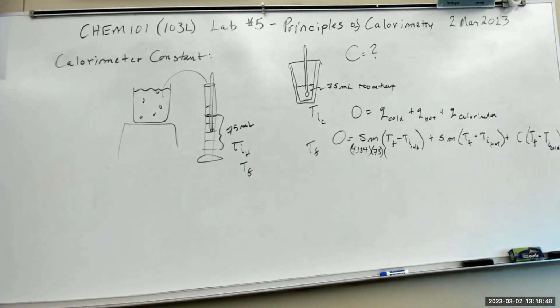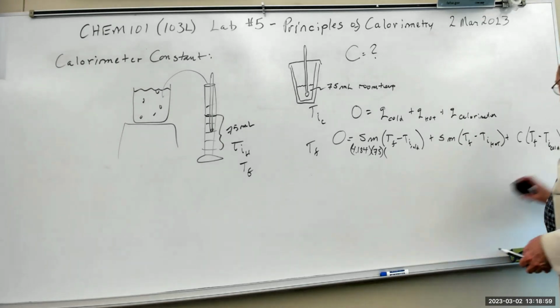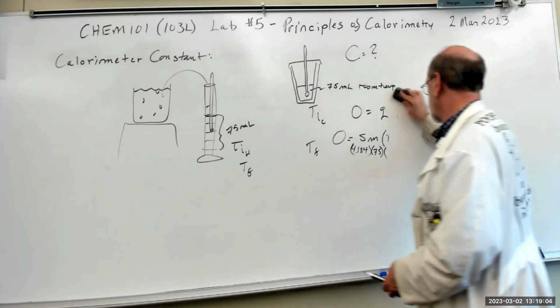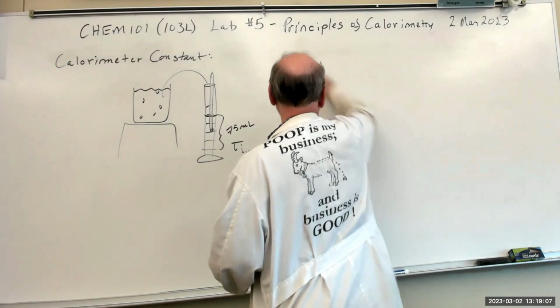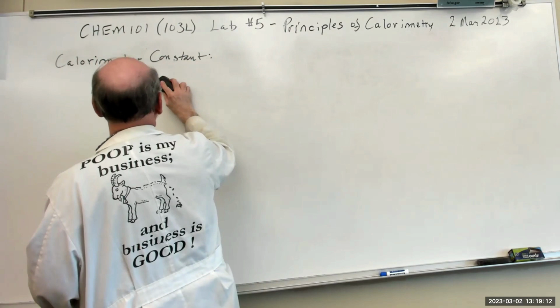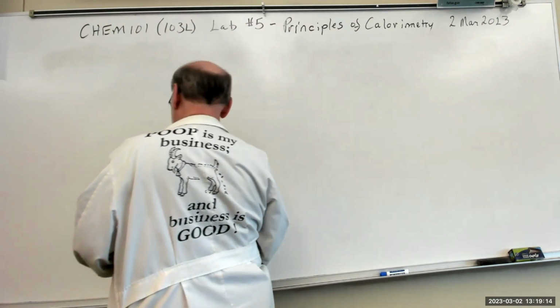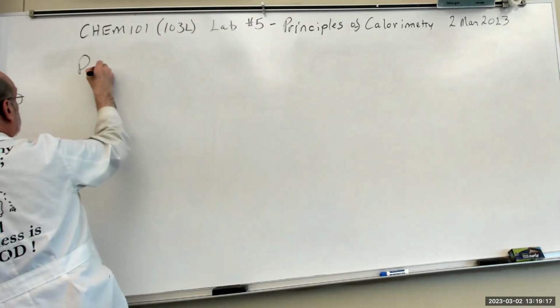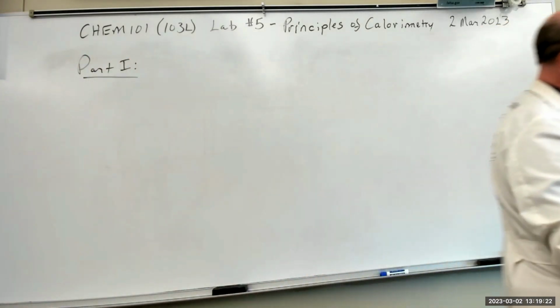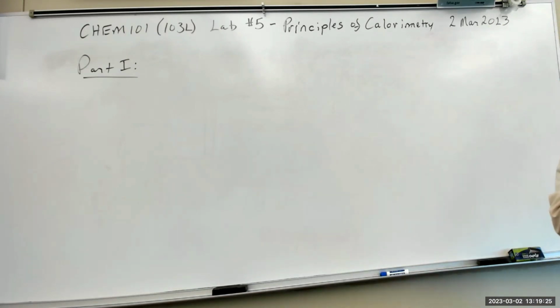All right. So then after that, we have 3 parts in the experiment. So part 1, I think, is the acid-base neutralization. Yeah, enthalpy of neutralization.